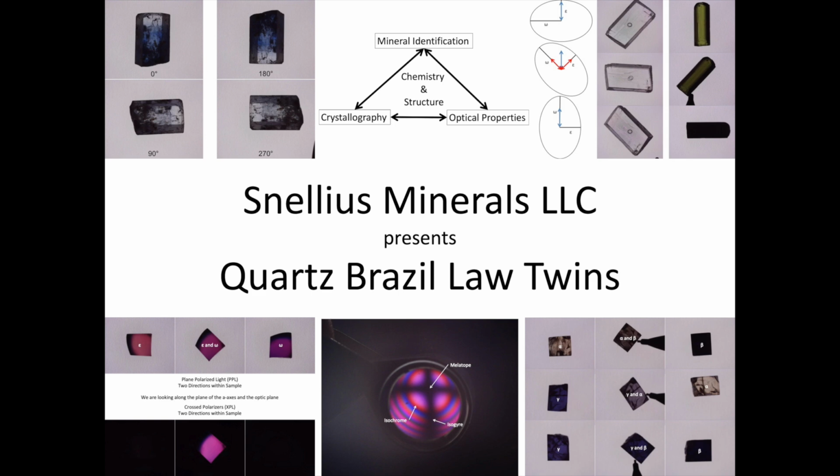Hi everybody! So today I wanted to make a video of one of the in-person optical mineralogy demonstrations that I do, and in this case we're going to focus on Brazil law twinning in quartz.